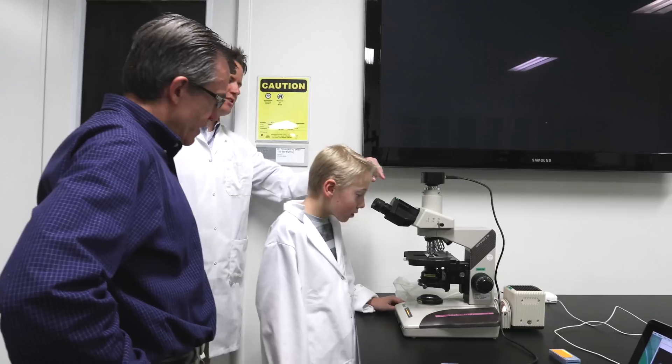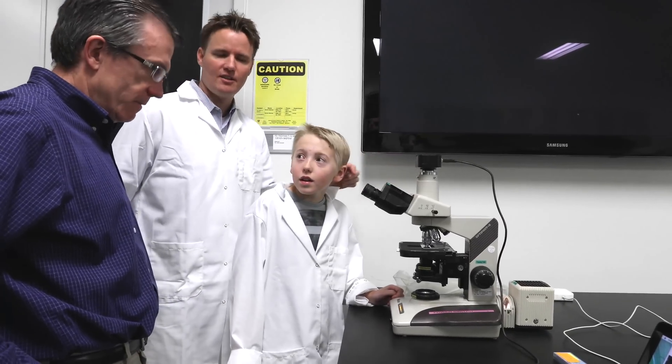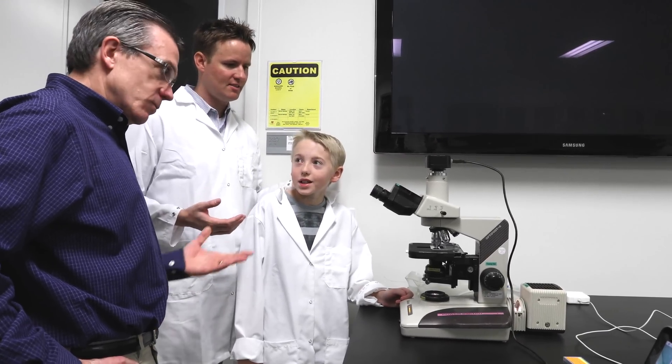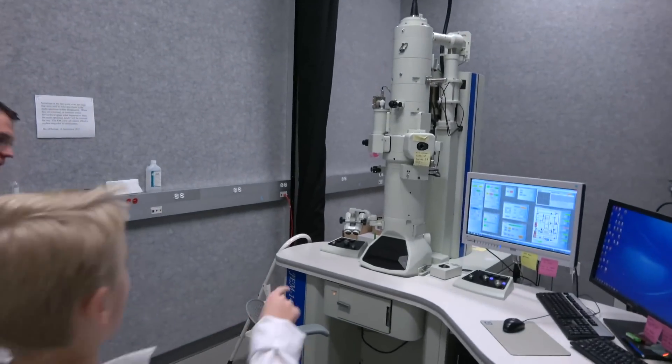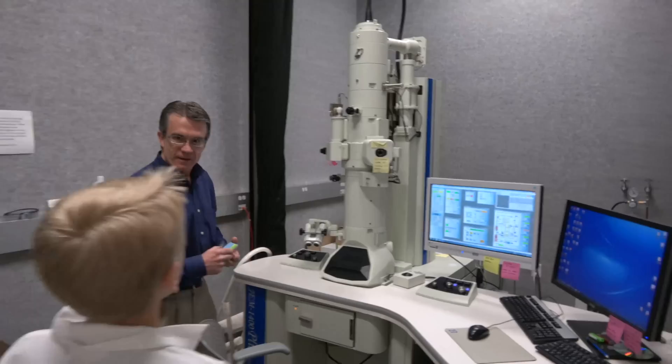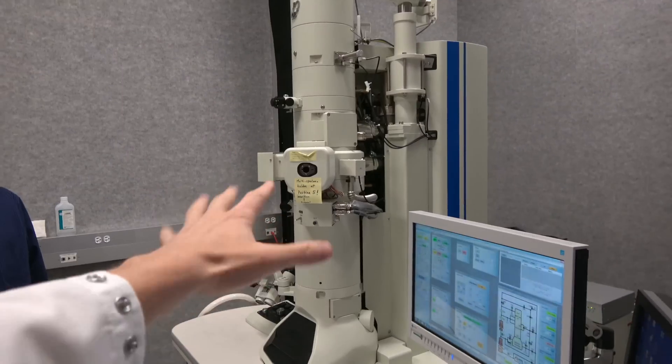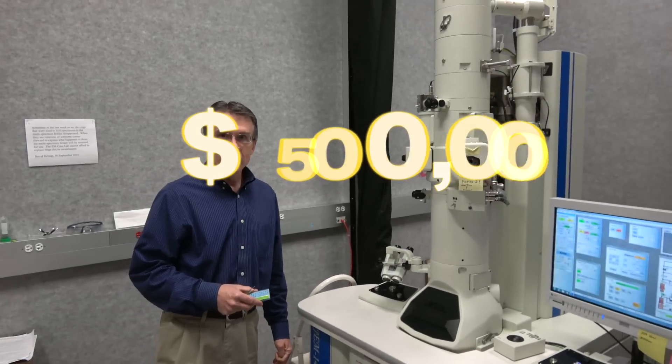Wait, but this is as far as you can zoom right here? Yes, right now, that's right. So what do you even use if you need to see the virus? We use the electron microscope. Are you ready, Lincoln? This is the electron microscope that we are not allowed to cut open. That's the microscope. This is it. How is that? Look at that thing.